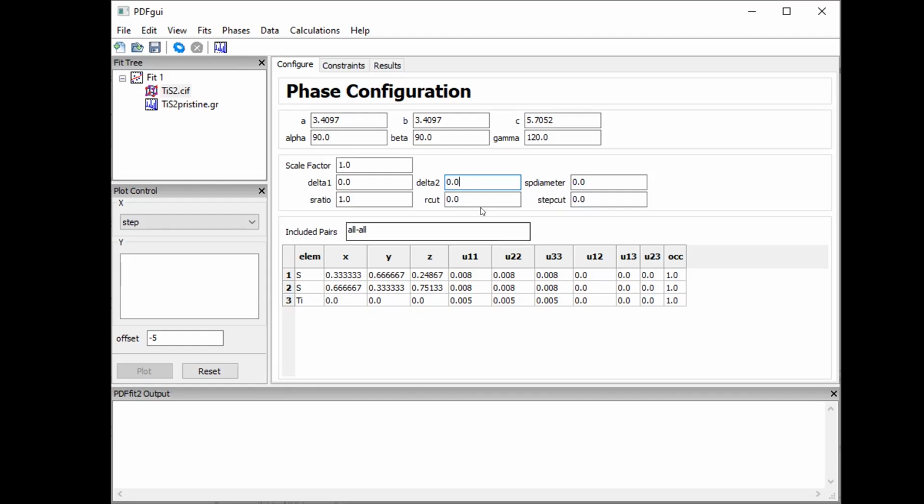And the next one I will be looking at is the atomic position. For atomic position, I probably would choose 3 digits, something like, let's say, 111 or 110, just to keep yourself reminded that those relate to the atomic positions. And those parameters are typically the parameters I refine last.